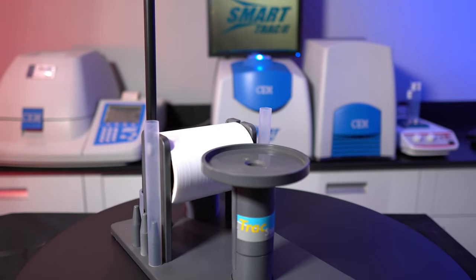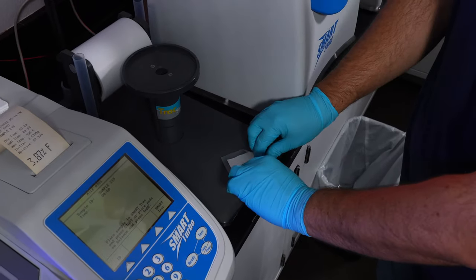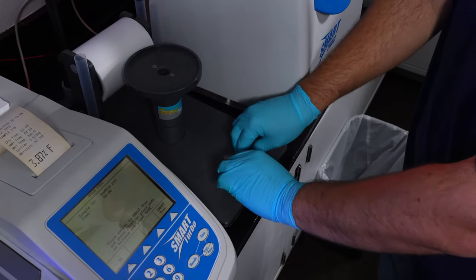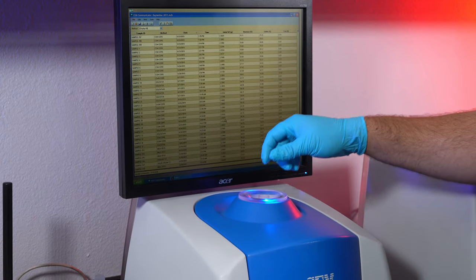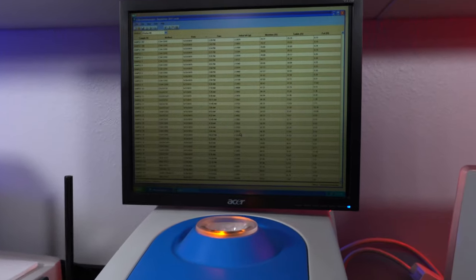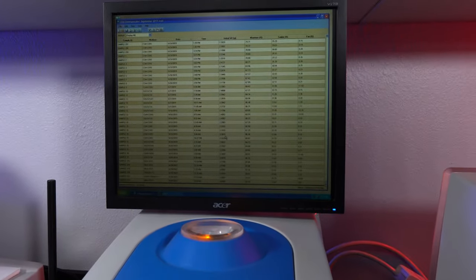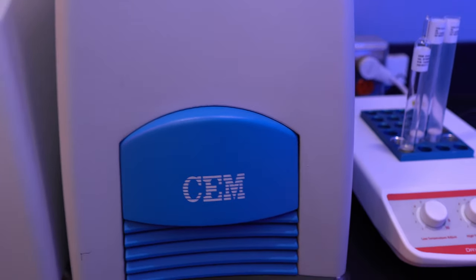The SmartTrack Station is used to hold the testing tubes, CM SmartTrack film, and gives you a place to fold your sample. The SmartTrack Magnet is where the tube gets inserted and the fat analysis takes place. This is also where the monitor is mounted to display current and past test results.